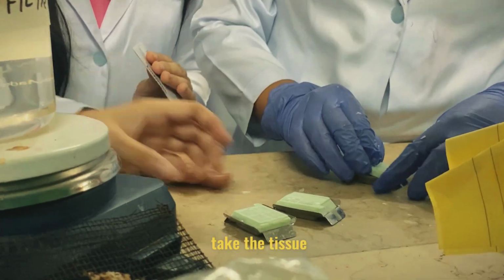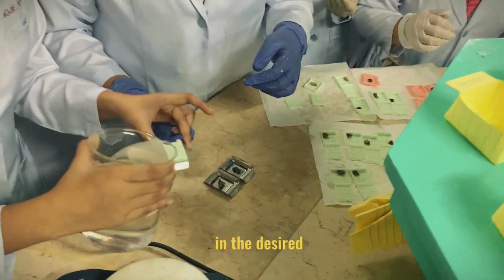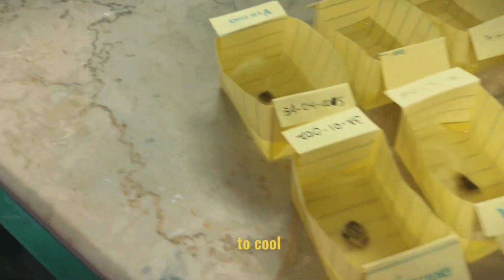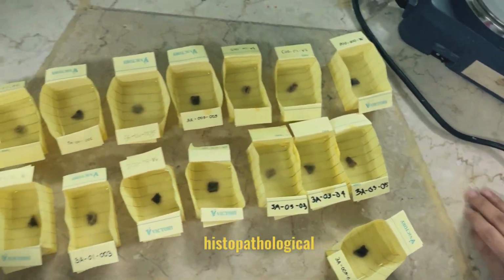Carefully take the tissue out of the infiltration vessel and place it into the mold, ensuring it is oriented in the desired position for sectioning. And finally, allow the paraffin to cool and solidify completely, which will encapsulate the tissue and prepare it for the next steps in our histopathological procedures.